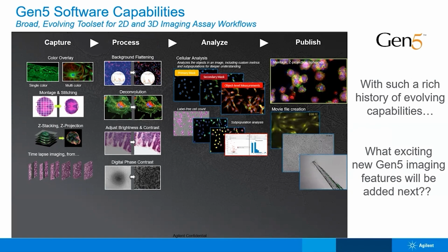But as we look to the future, we really want to gauge where and how the market is evolving, not just 3D applications, not just live cell biology, but things like AI analysis, cloud software, 3D tools, object tracking, neurite outgrowth, and things like this.